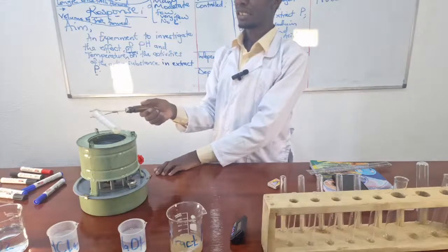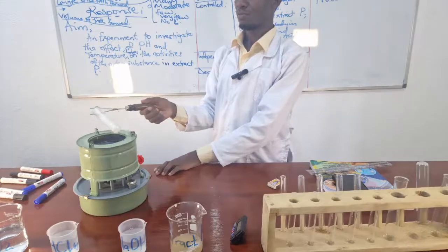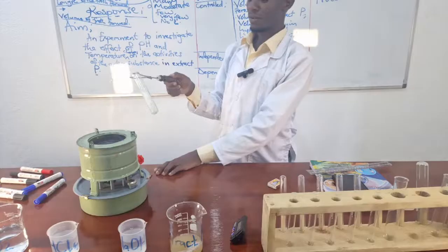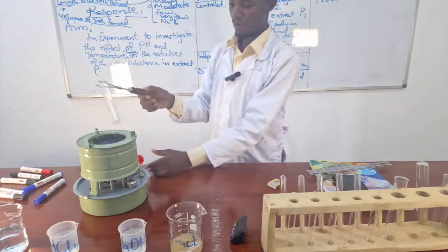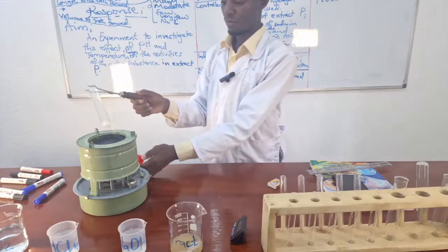I'm boiling the extract, a sample of the extract. I'm boiling it for some time.